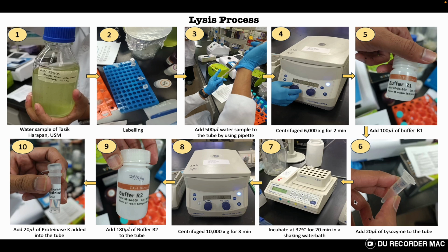The incubation is to ensure complete lysis of cells in the suspension. This digests proteins and lipids, and also breaks down cellular materials and makes the DNA free.